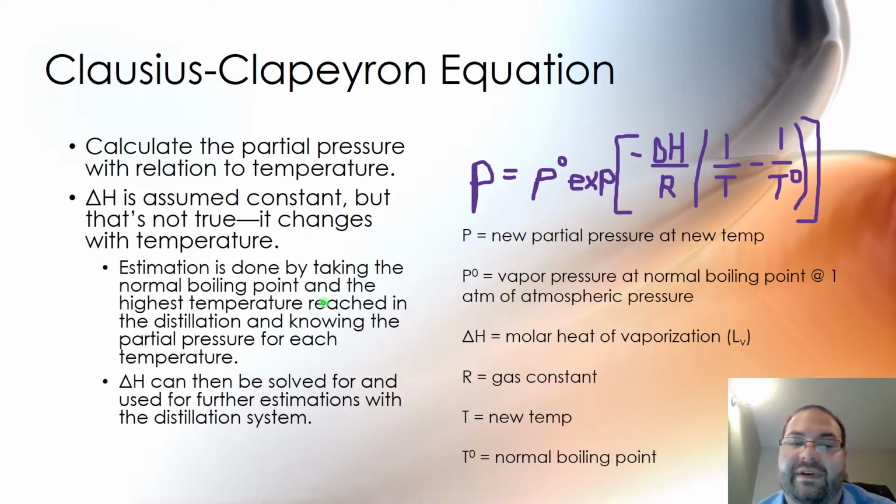So it is a very broad estimation tool, but it turns out that it does predict pretty well the numbers we should see in some of the smaller fractional distillation setups that we're going to work with in our lab. So it can work in this way, but when you take further courses with this, you'll have to actually do some calculus to account for little changes that occur over time and over temperature differences in this equation.